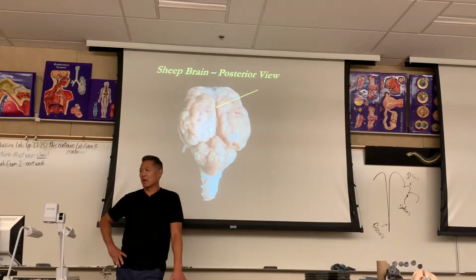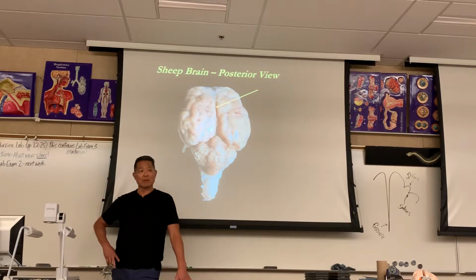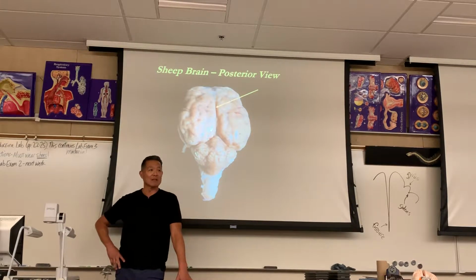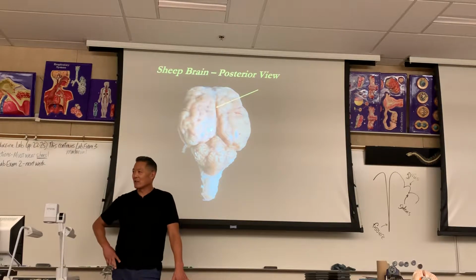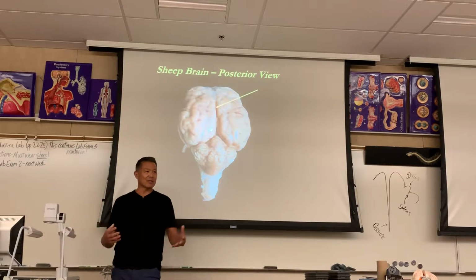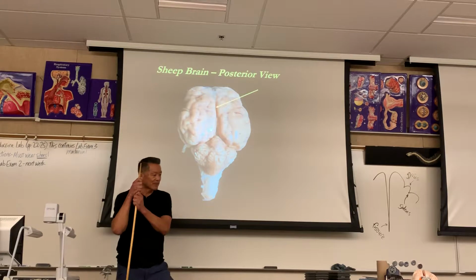And it's a good thing that we have slides on the PowerPoint, because there will be 2 sheep brain stations on lab exam 3. So while we're doing the dissections, just be sure to remember that you're not just fooling around this afternoon. You just actually want to be serious about the dissections, because there'll be dissected brains.